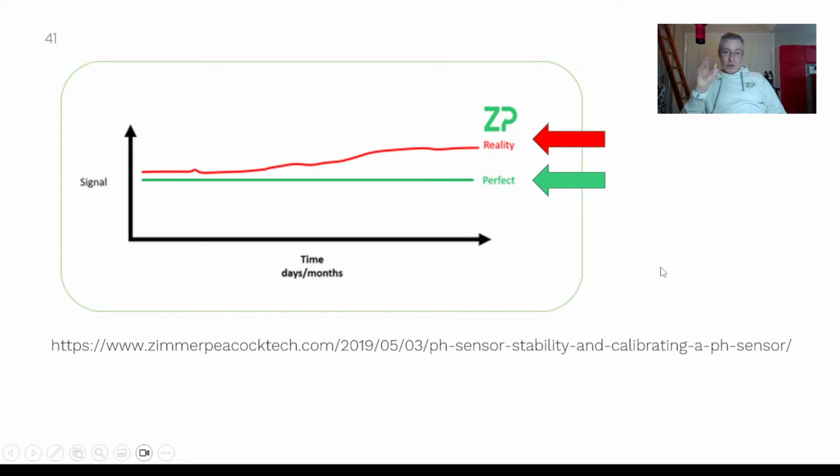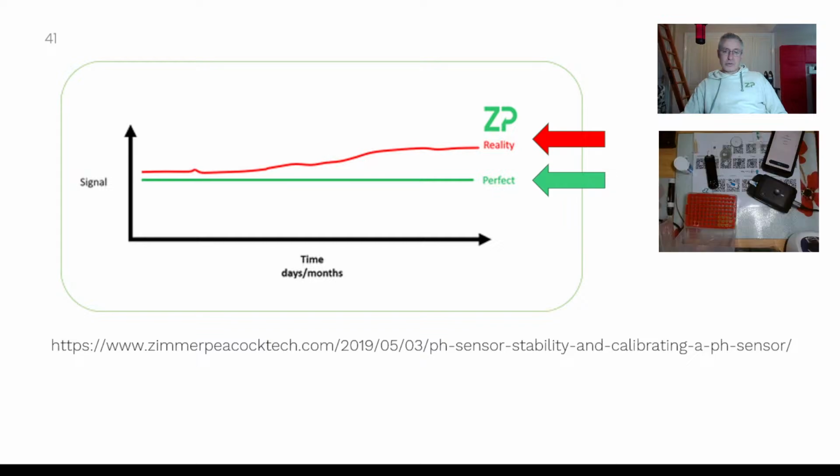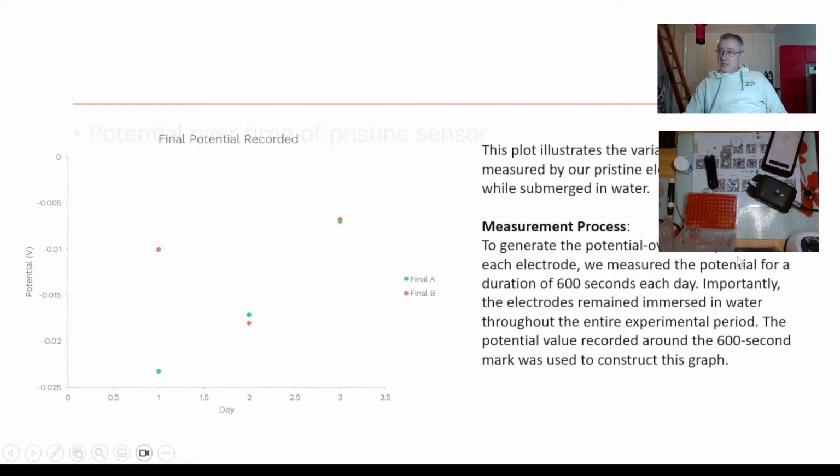I've always been quite open about, in particular, open circuit potentiometry can be quite a sensitive technique to not just the analyte of interest, but the matrix, the sample in which you're testing. And I think some of the problems this person has, I say problems, their signals are well within my expectations, but I think their solutions are not quite as stable as they would otherwise think. So I appreciate them giving me all this data.